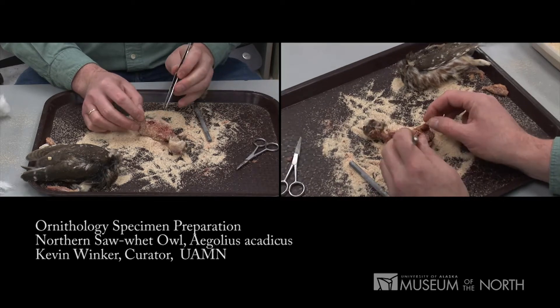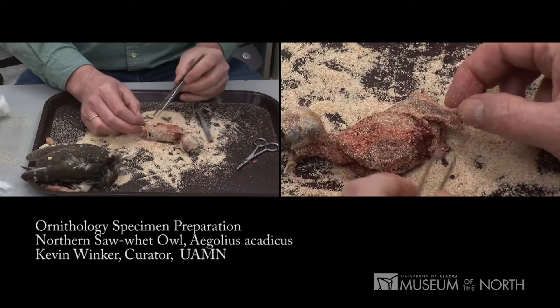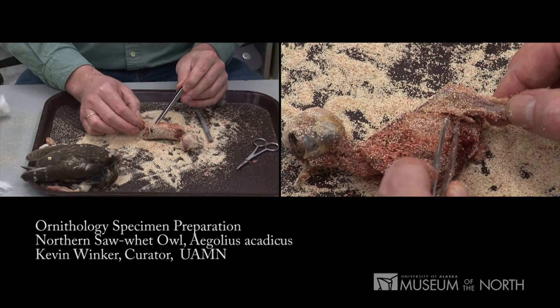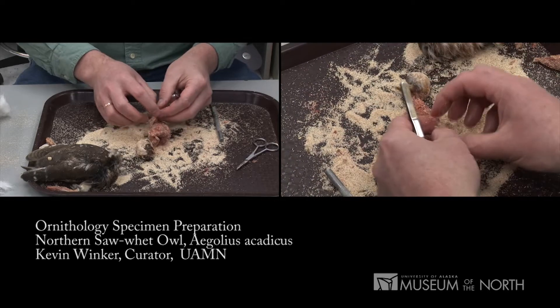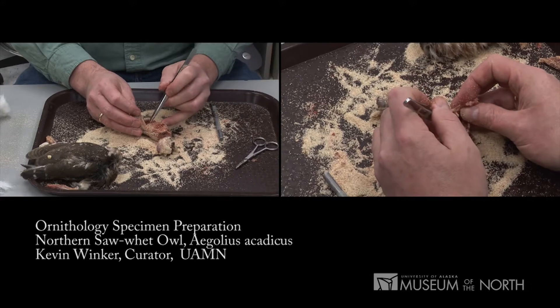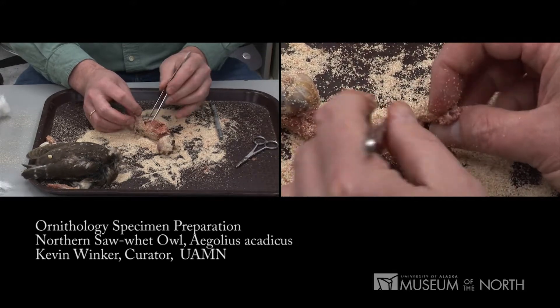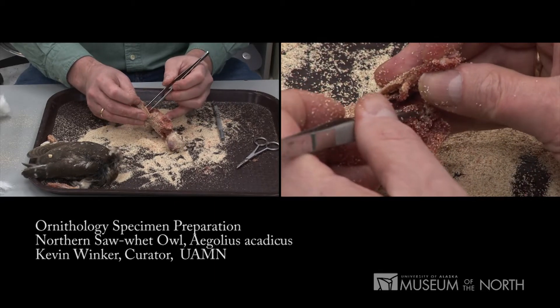Determining a bird's sex involves opening it up from the left side. Here's the bird's back, head forward, left leg. Sex organs go in here, right at the rearmost ribs, and you look for the sex organs where the ribs and the leg actually join together up against the dorsal side of the bird.